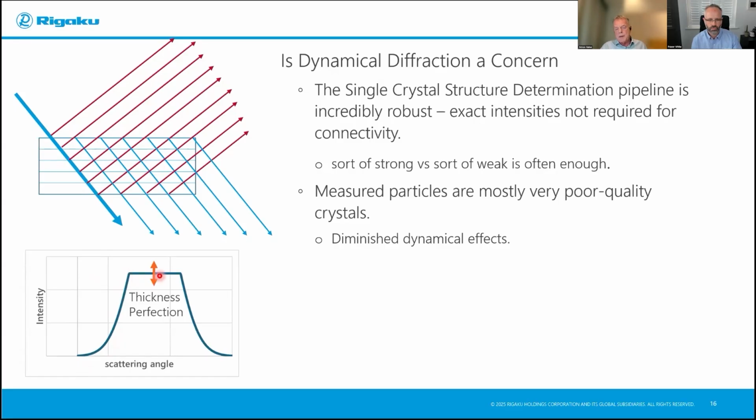And once that happens, you'll then hit this interferometer situation, and most of the electrons that are supposed to pass into the diffracted beam can be completely lost within the sample itself. So this gives a flat top peak, which is called a Darwin curve. And it's only in this range of the Darwin width itself that you're getting dynamical diffraction. And most Darwin widths are like 0.002 degrees. They're extraordinarily narrow.